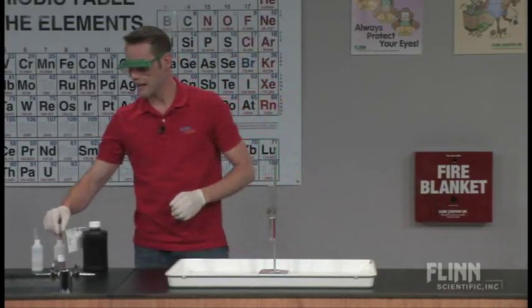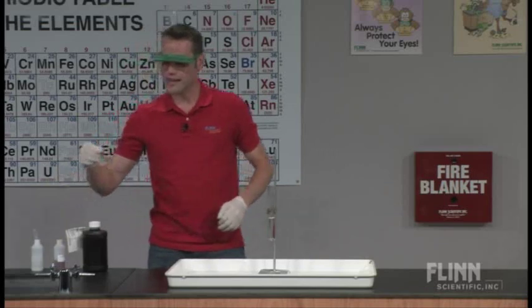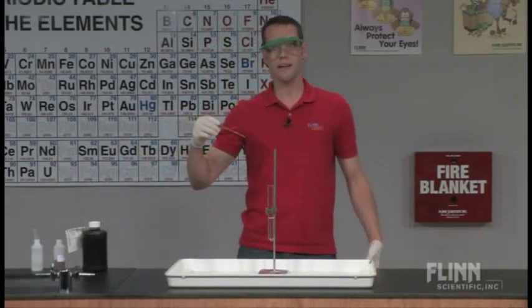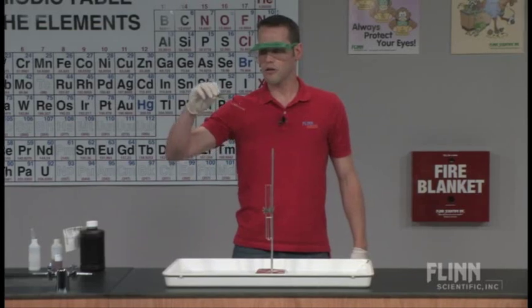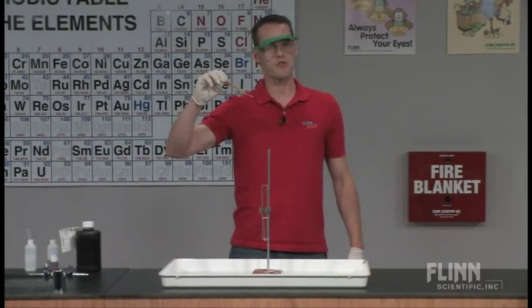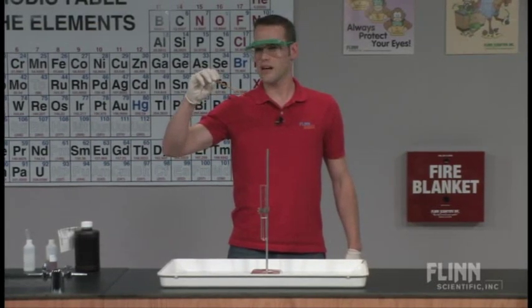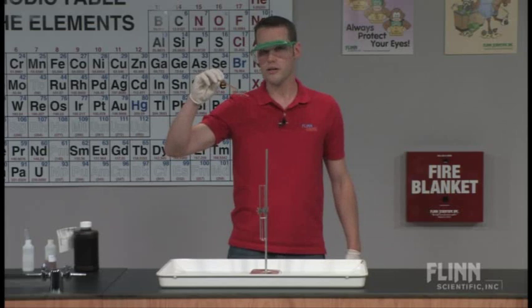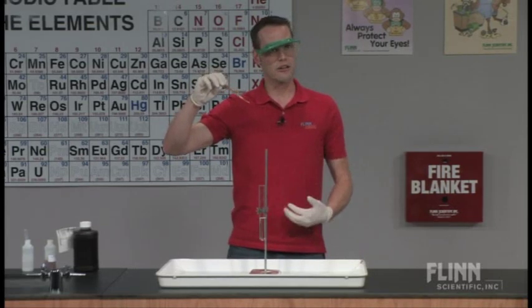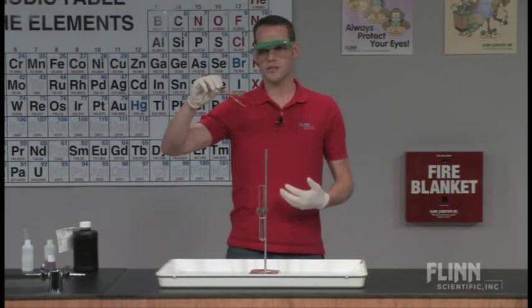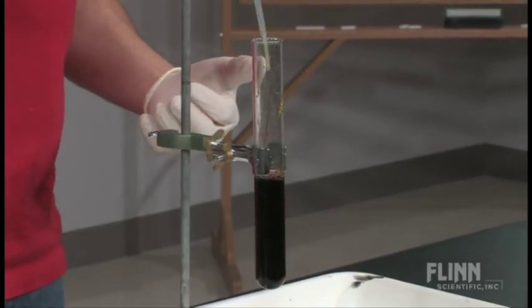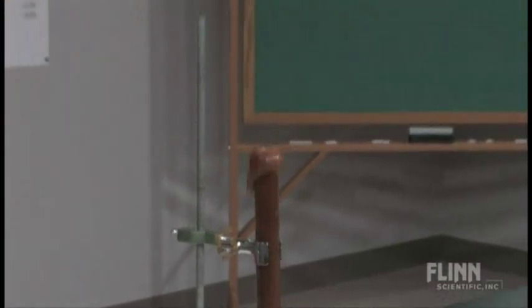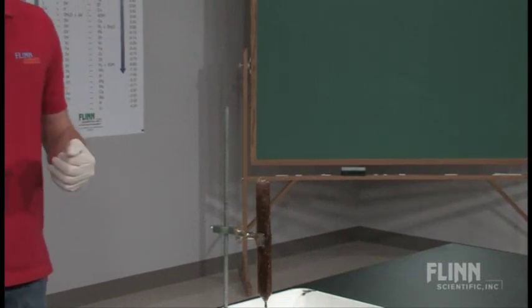I'm going to add a catalyst. The catalyst I'm going to add is iron chloride — this is a 0.1 molar solution. Iron chloride does give you a nice yellow color. I show my students the color before I start the demonstration, and then they can see a very clear color change as soon as this contacts the hydrogen peroxide solution. If I squirt some of this in, you can see right away you get that dark brown color, and it starts to foam over.